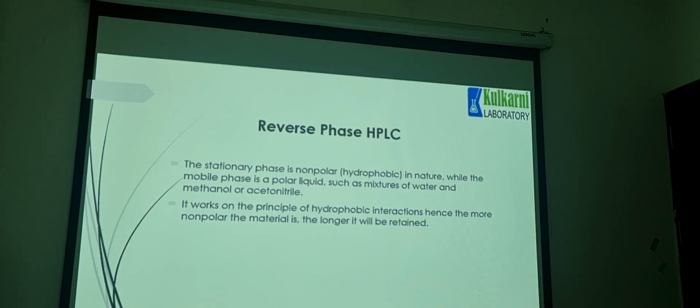mixture of water, methanol or acetonitrile. These are all polar solvents. So in this case you are using water, methanol and acetonitrile. It works on the principle of hydrophobic interactions. Hence the more non-polar the material is, the longer it will be retained. Exactly the opposite condition to normal chromatography.